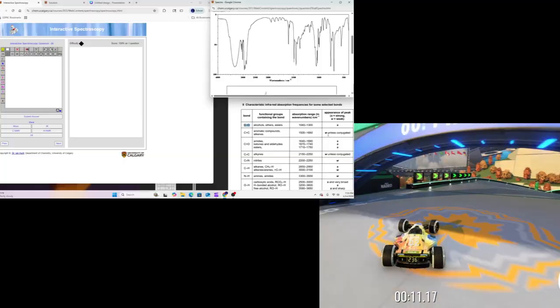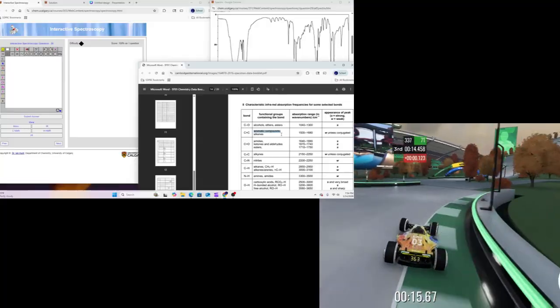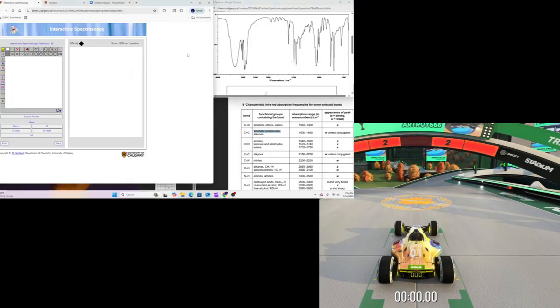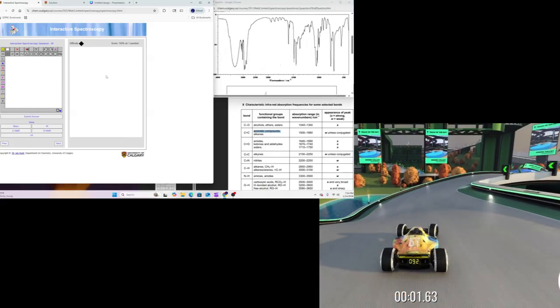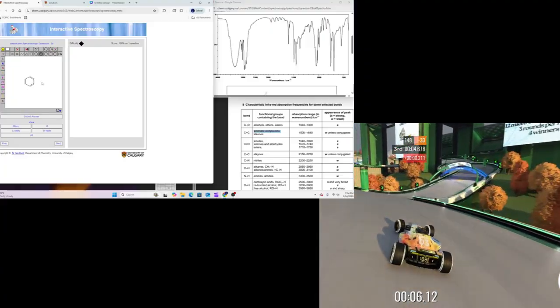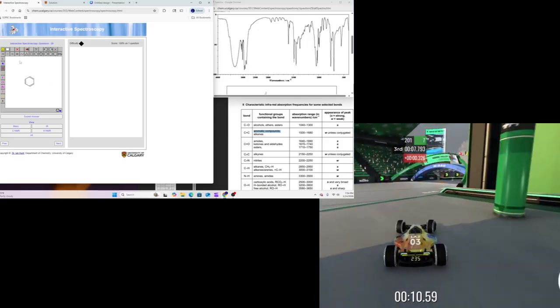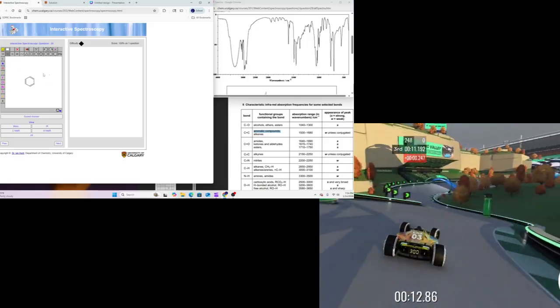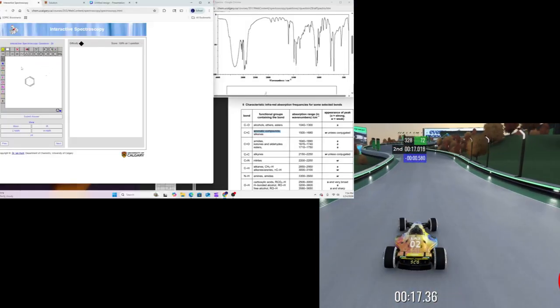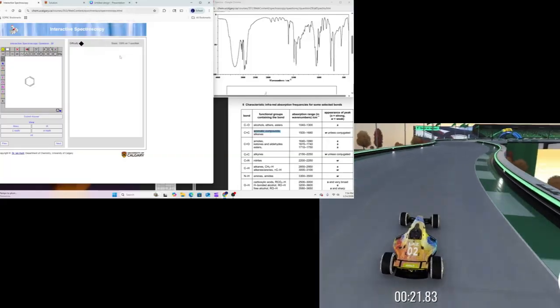This is going to indicate our aromatic compounds here. Okay, and we're going to notice that when it's like right here. So that means that we're going to have an aromatic compound. So we're going to have one of those carbon rings, and we know it's going to be there already. And we're going to have an OH. Okay, so I'm going to put another carbon here, and it won't let me do that, of course. And we're going to have an OH in there as well.